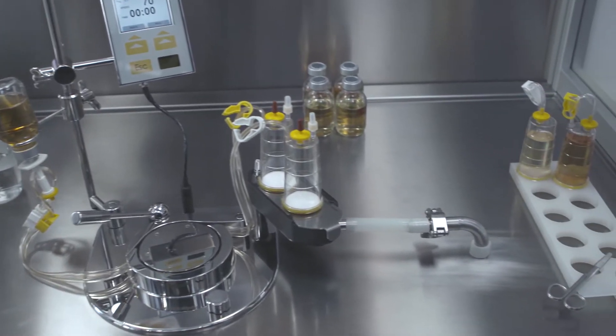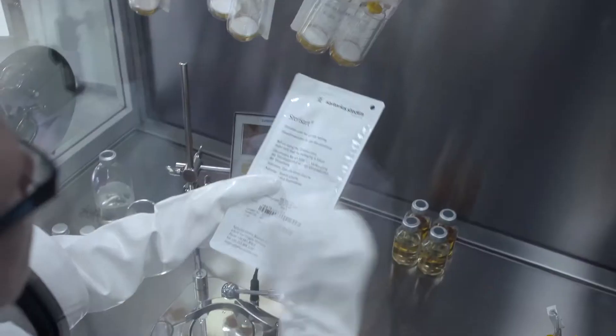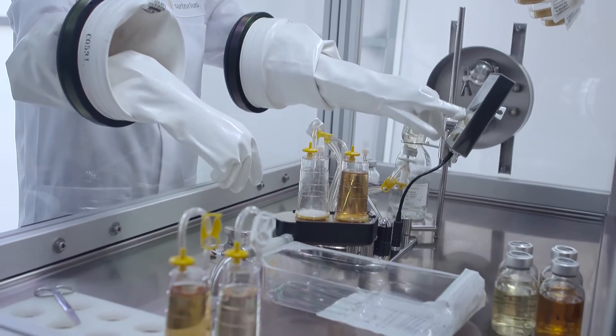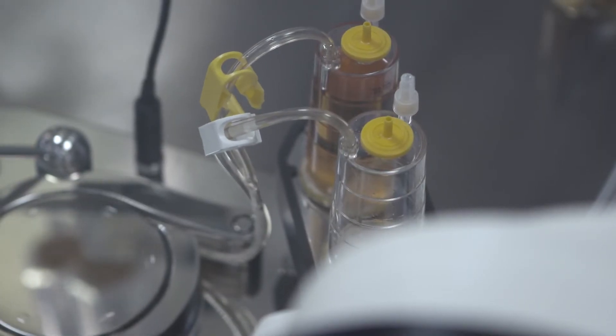For the dedicated sterility test, you need high-quality materials that provide adequate and reliable test data. Our Sterisad NF disposables have been designed specifically for this purpose.